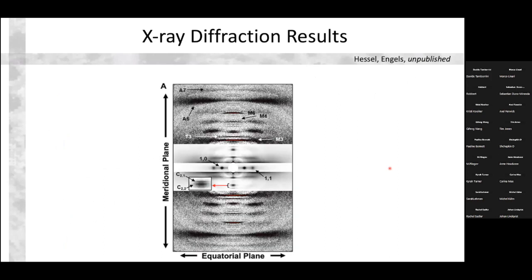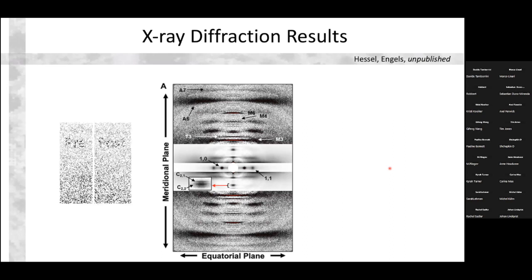Okay, so the X-ray diffraction results, I'm super excited to show you these. I think that you guys are the first people to see anything like this. And so I'm really thrilled that Anthony has worked with my student Nick Ingalls to actually reduce the data that I'm going to show you here. But this is one of our reflection patterns from the psoas muscle here.